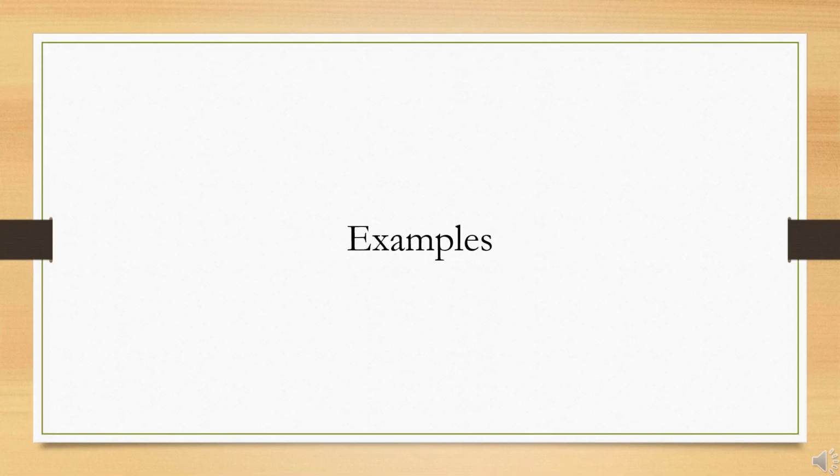After listening to the explanation of what infrared spectroscopy is and how it works, let us move on with some examples of the important information that we can extract from an IR spectrum and how it relates to the characterization of polymer. In this video, I'm going to give 3 examples related to the characterization of polymer.